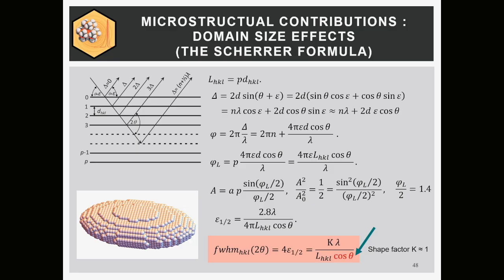People say crystallite size, but it's not a crystallite, right? It's a coherently scattering domain. One crystallite could consist of 50 of these, okay? You're lucky if it's 1 to 1, but usually it's not. But we get the size of the coherently scattering domains because we can distinguish it from the strain, because the dependency on 2 theta is different.